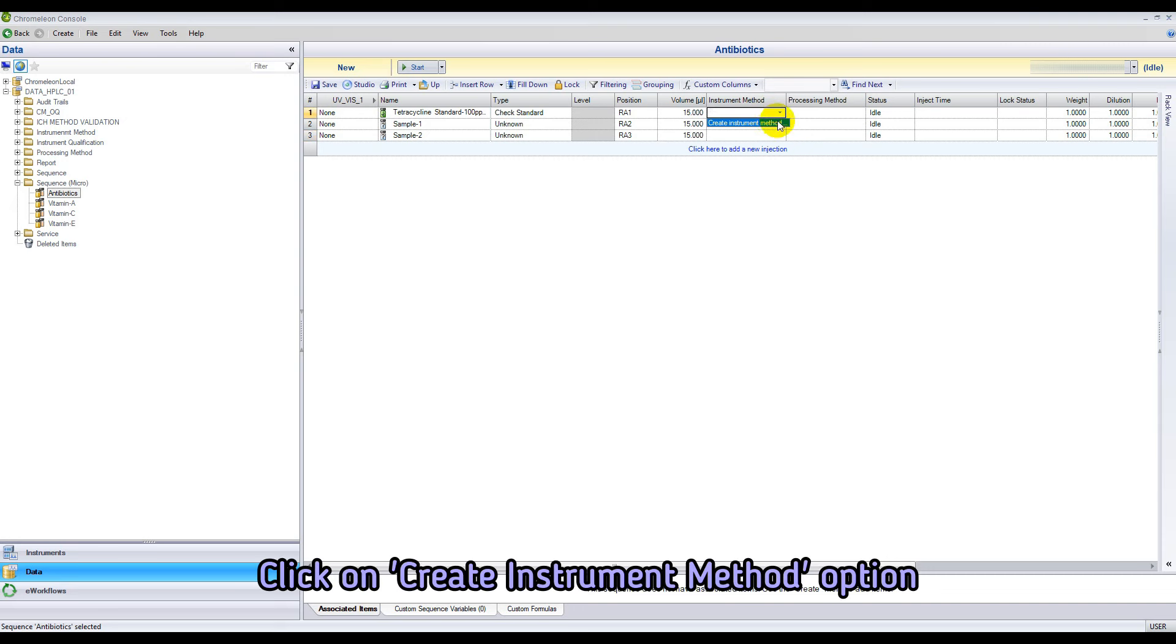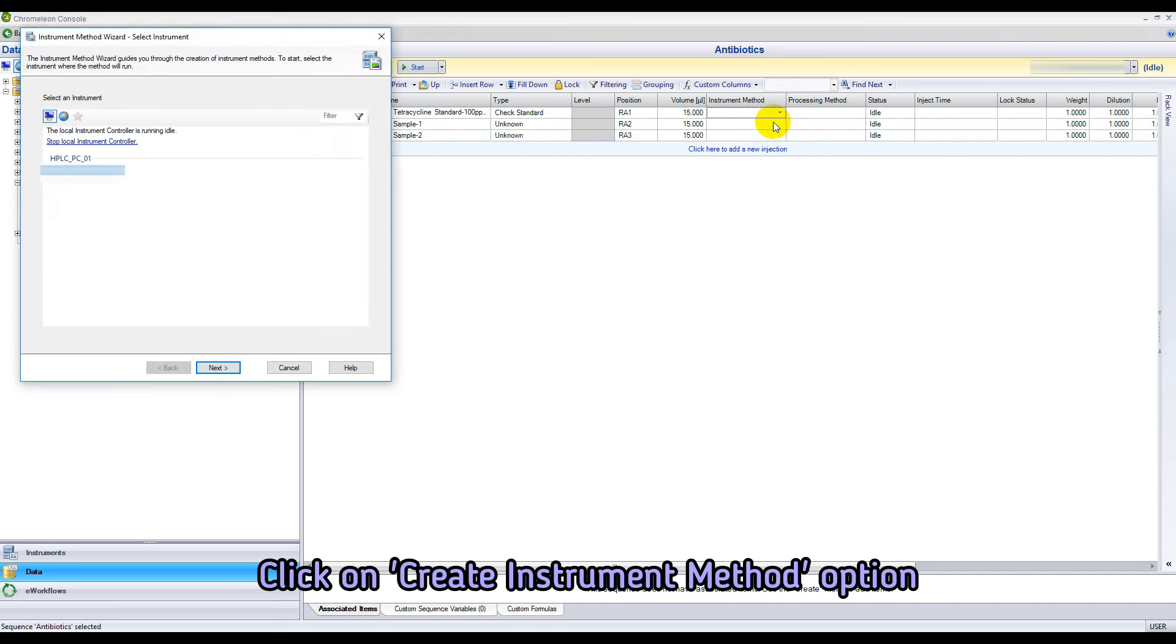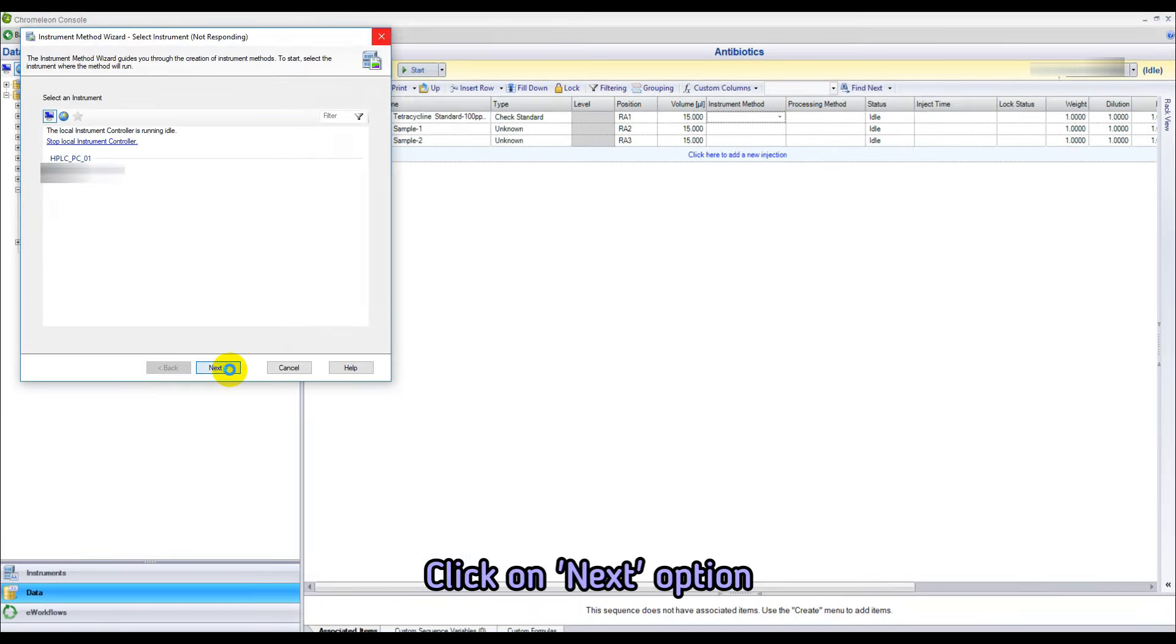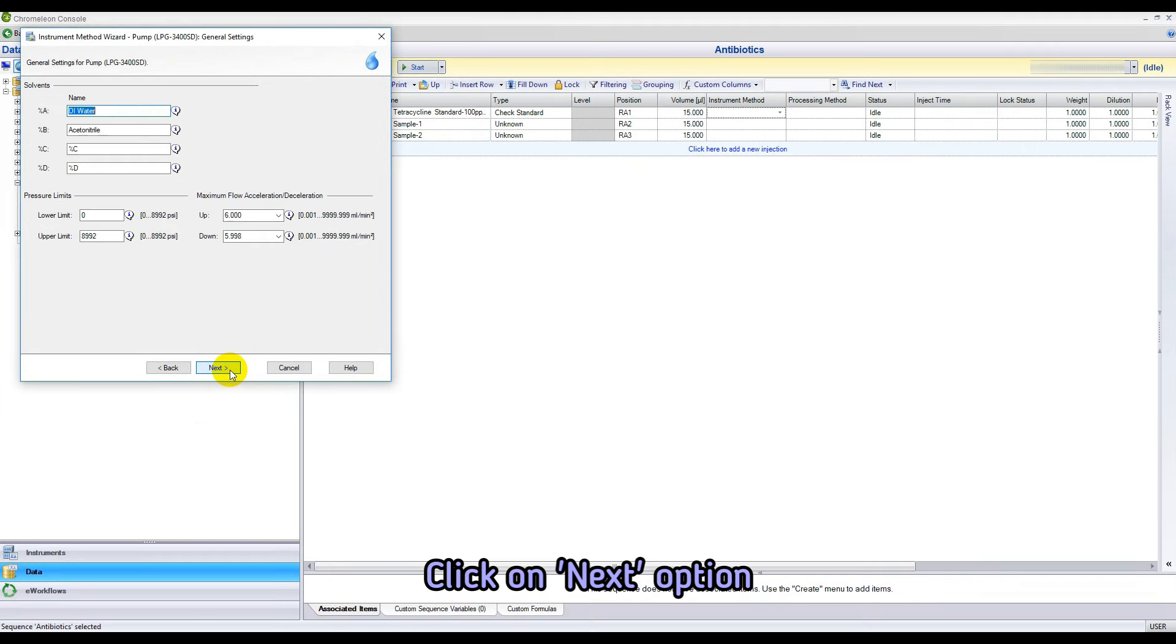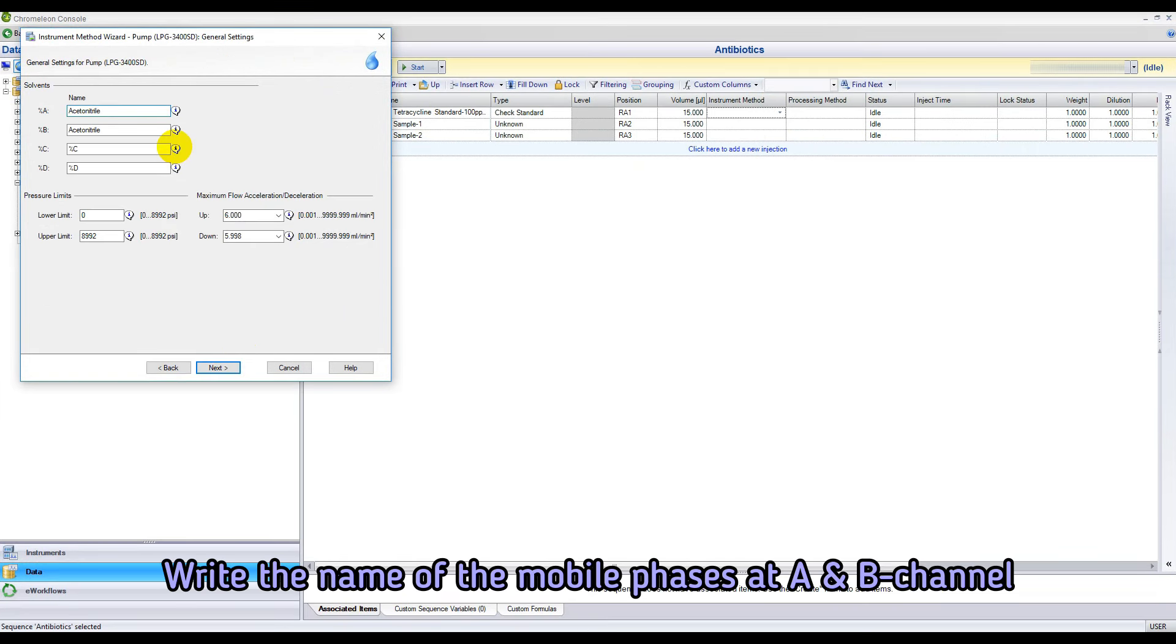Now we have to create an instrument method for this analysis. Set the runtime at 20 minutes. Write the name of the mobile phase at A and B channel.